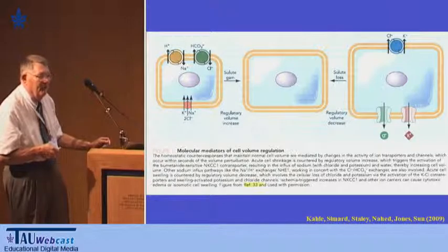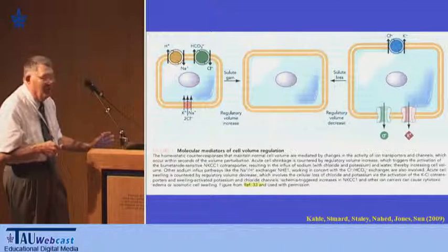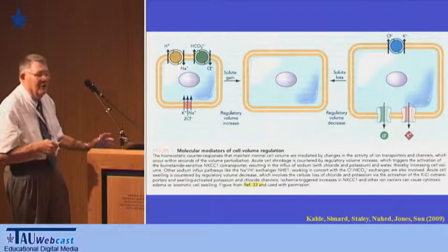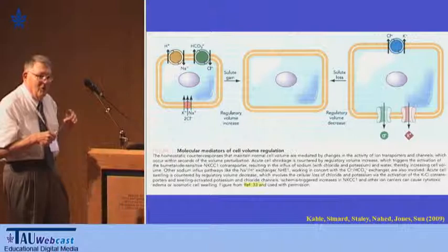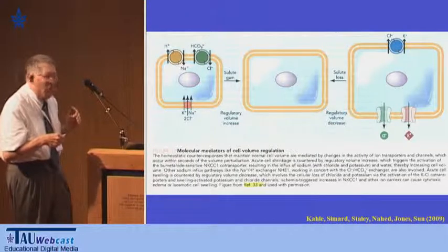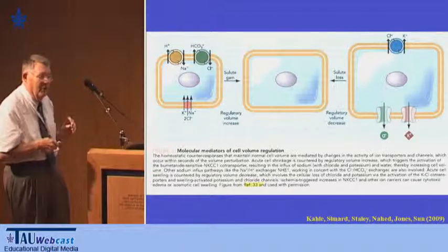But it's really important, I believe, to note that almost all of what has been learned in recent years has been done from experiments like this, where you set up an artificial osmotic gradient that the experimenter induces, and you watch a non-equilibrium water flux to either shrink the cells or swell the cells.